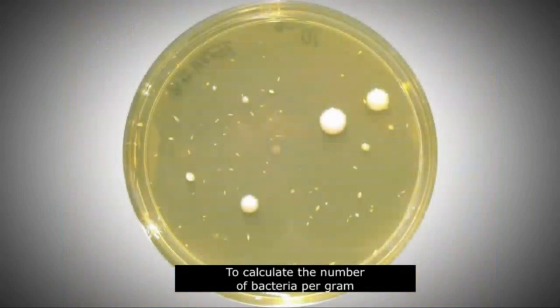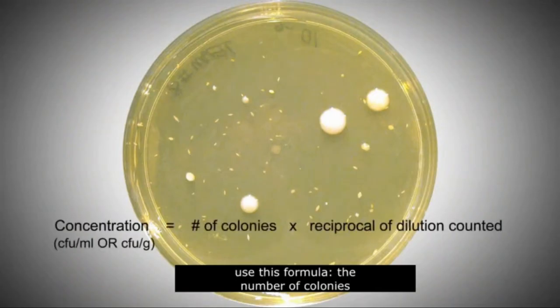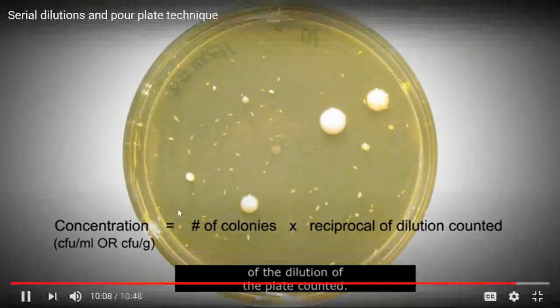To calculate the number of bacteria per gram or per milliliter of the original sample, use this formula. The number of colonies on the countable plate is multiplied by the reciprocal of the dilution of the plate counted.